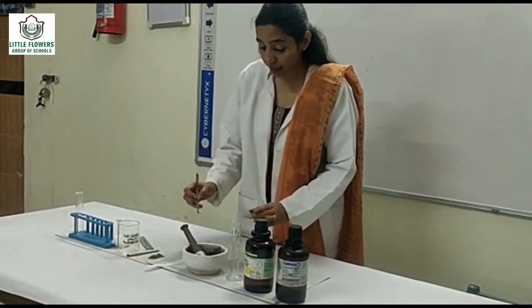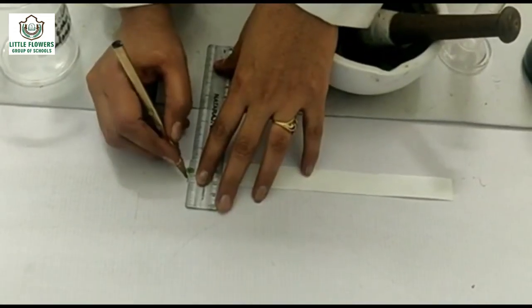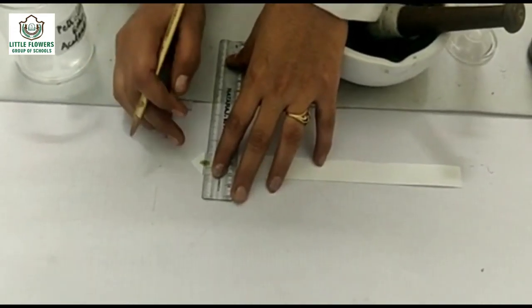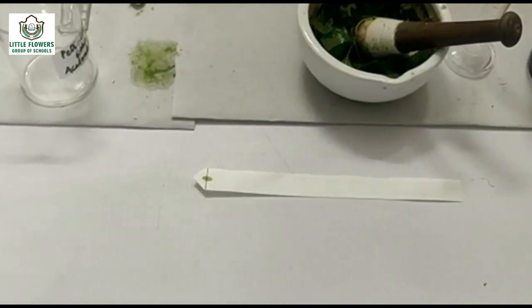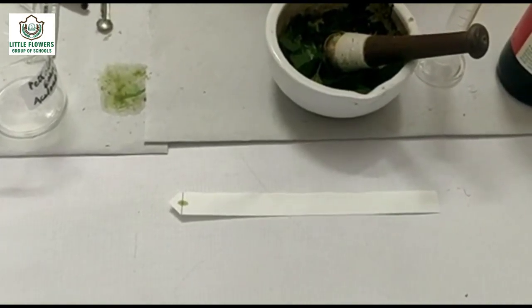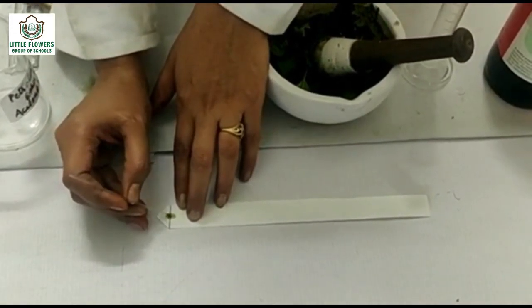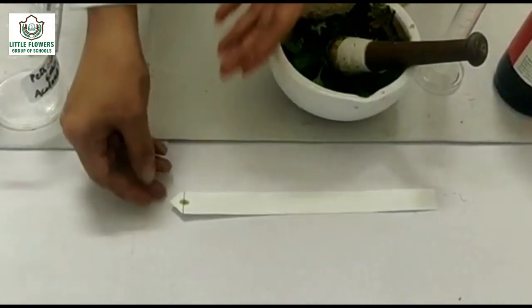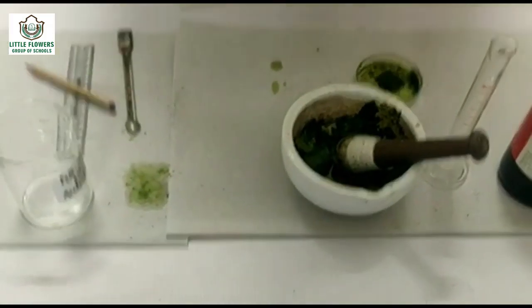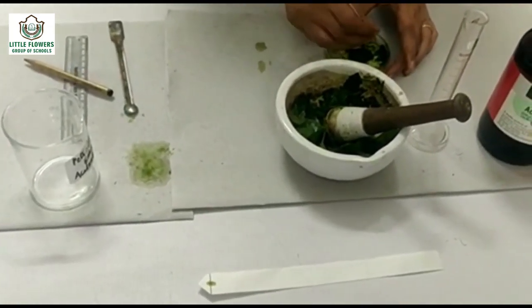After this, take some extract from the mortar into the evaporating dish. Put a line on the filter paper, 1 cm above the tip of the paper. Now with the help of a capillary tube, put some extract on the middle of the line. Dry the drop and repeat the process 4 to 5 times.